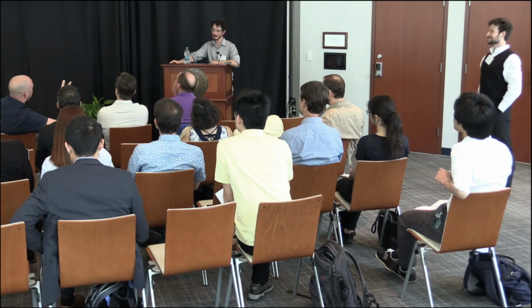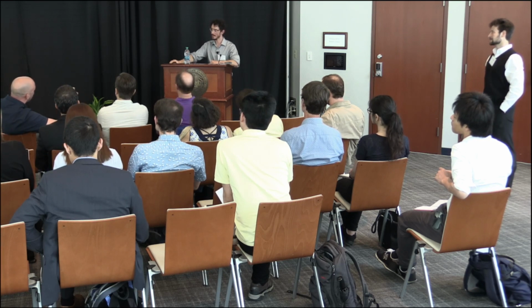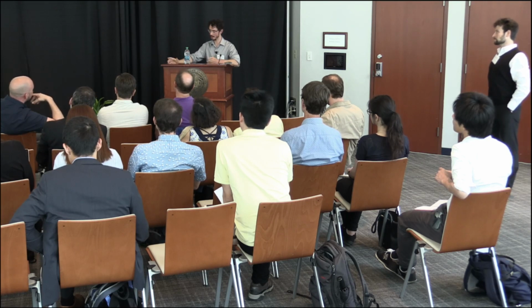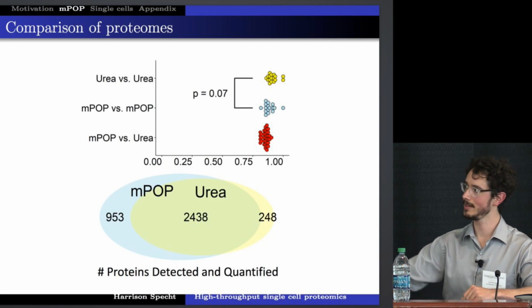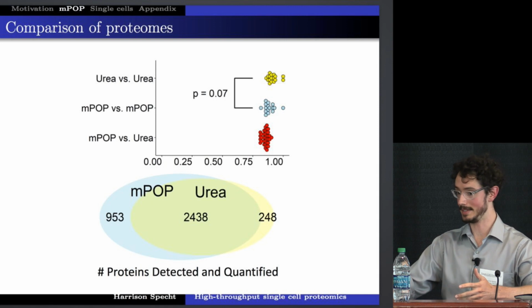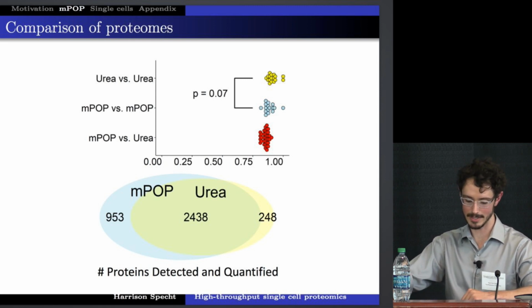Well, we're just wondering if it would be better to digest for 3 hours, and why would that be? Is that better because you're not getting carbamylation overnight? We included that condition. That is one consideration for the comparison, certainly, the carbamylation from the urea. But I think we did the 3-hour digest looking way down the line because we'd like to process these single cell plates in a day and minimize any losses that might happen through surface absorption overnight, over that long period they'd be incubated in there. So we included those samples, and I should identify the dots by the digestion length.